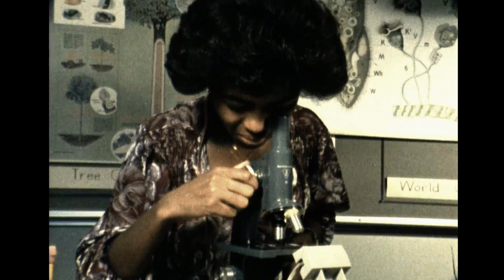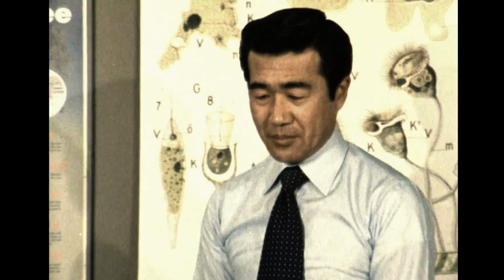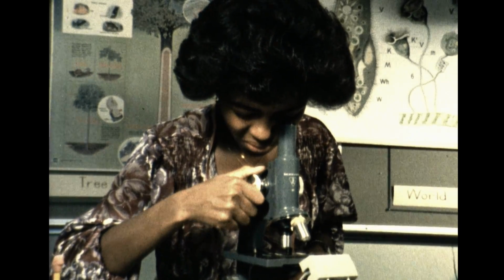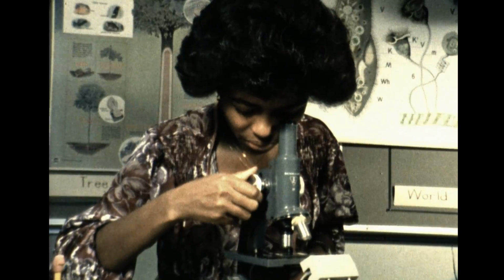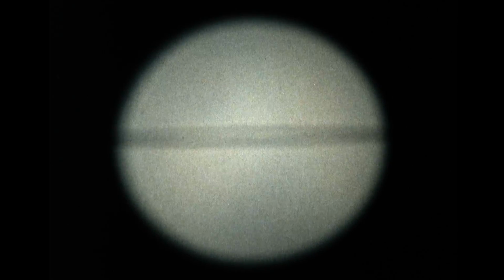9. Focus mainly by raising the lens with the coarse knob. There is a reason. These lenses are very soft. They can be damaged if they are lowered and pressed against the slide. The student coarse focuses the hair. The image comes into view.